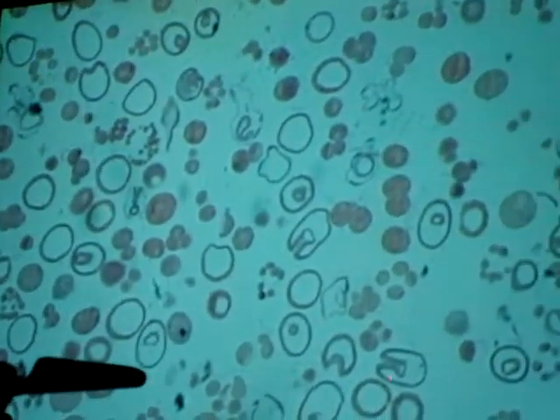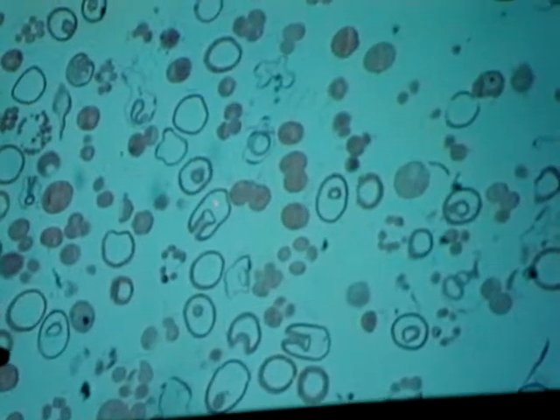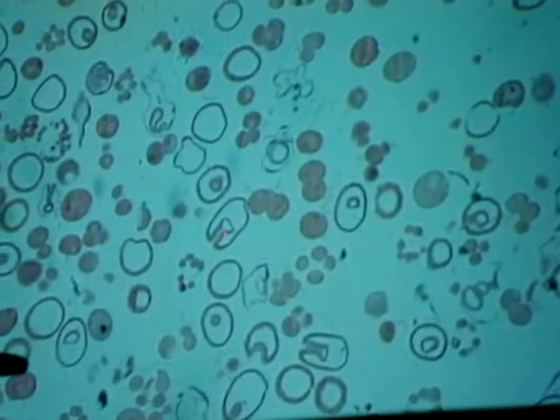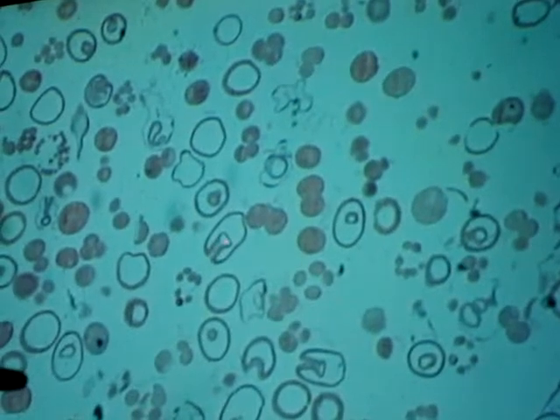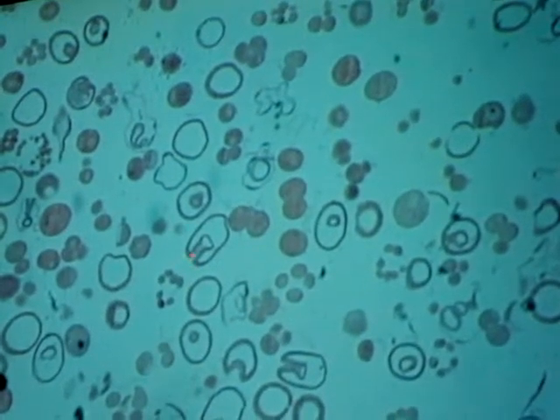Early, but getting there. A little bit more clumps in there would be okay. And then this one, gastrula. And then the space again is the blastocoel. The outer ectoderm, the inner endoderm, the channel or the canal, the archenteron, and then the opening here, blastopore.